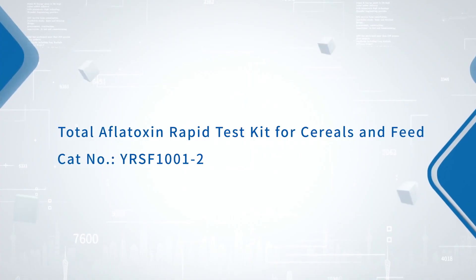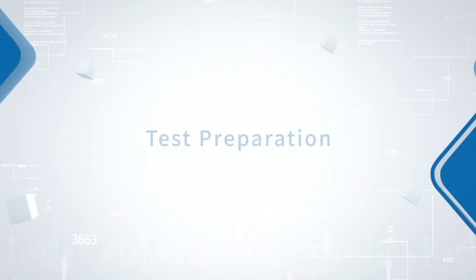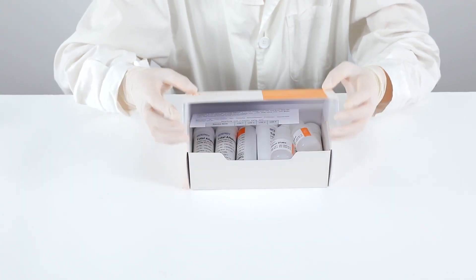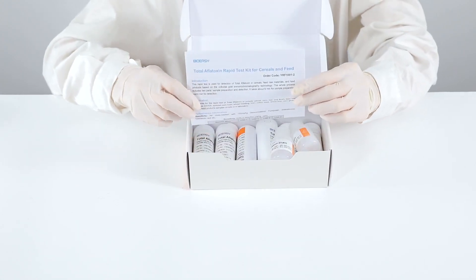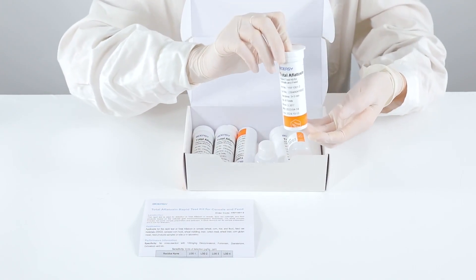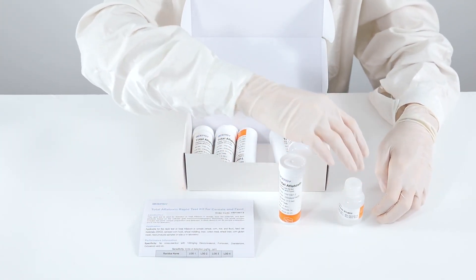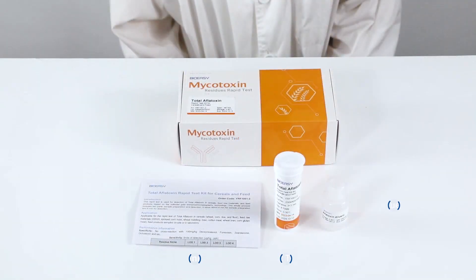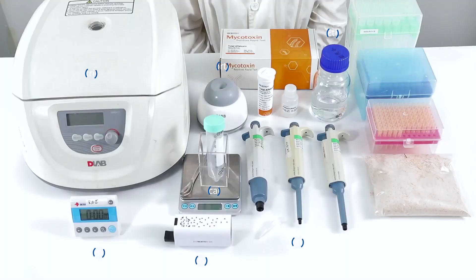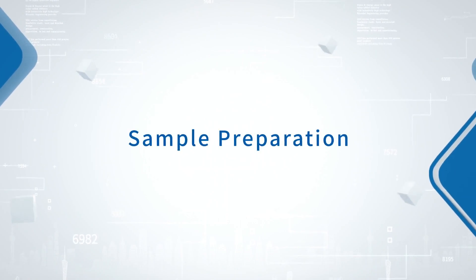Total aflatoxin rapid test kit for cereals and feed. Test preparation. Sample preparation.